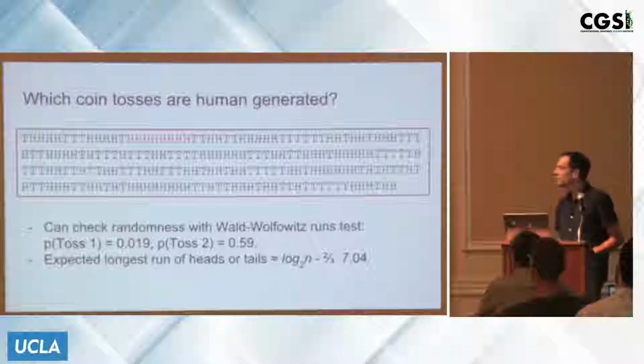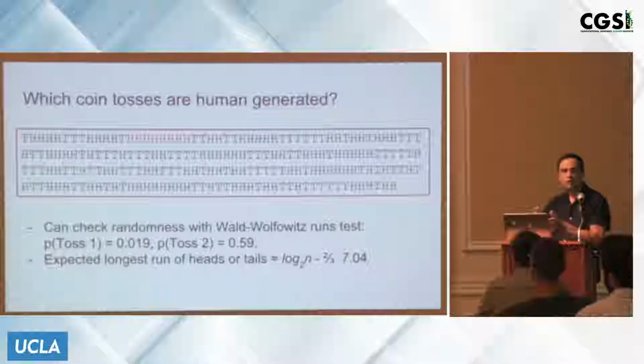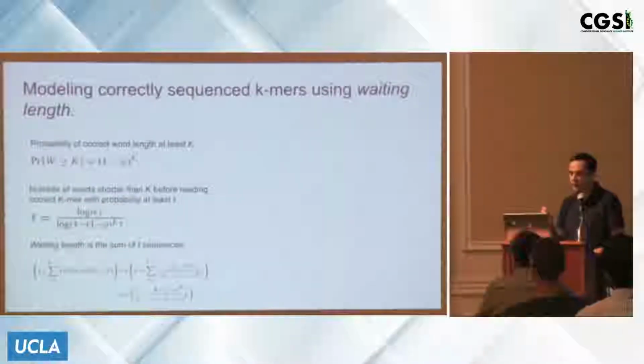If the error rate is, say, 10%, we don't expect there to be one error every 10 bases all of the time. And since the errors tend to have larger runs, we then expect there to be larger matches that we can anchor off of, even though the error rate itself is fairly high.